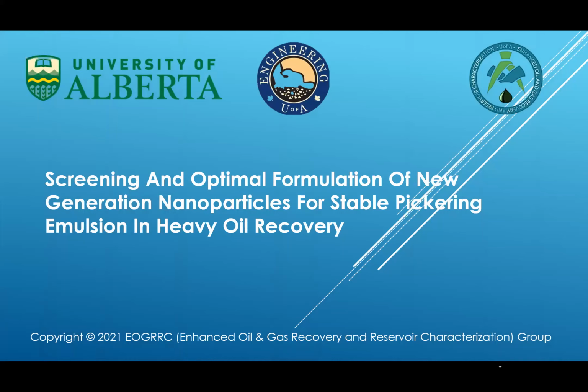The objective of the study presented in this video is to screen the effective emulsifier for oil and water emulsions from a broad range of solid nanoparticles. Suitable Pickering emulsifying agents that can render emulsions stable at relevant conditions will be identified. The effects of some physical parameters, such as particle concentration, water-oil ratio, and temperature, that affect emulsion stability will be investigated.